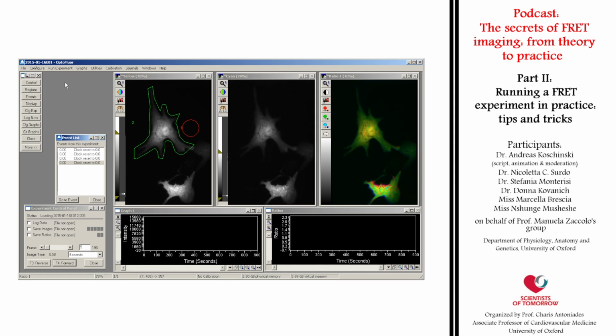Usually we are doing all mathematical operations in Excel or OpenOffice. However, as we are analyzing now, and this will not influence the already acquired images, you could also do some operations in the MetaFlow program. Especially if you want to export ratio images for documentation, it might be quite handy to subtract backgrounds or shadings.